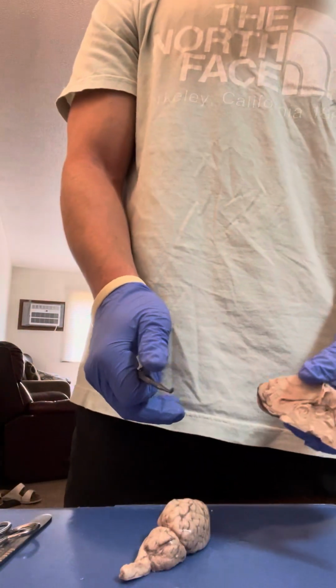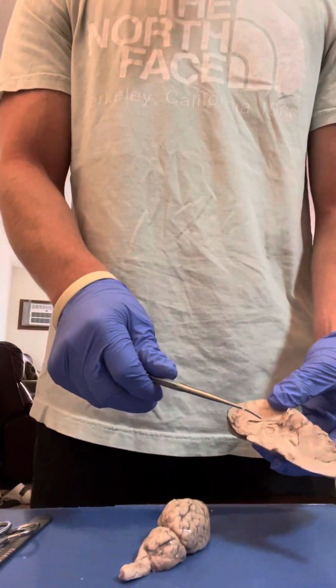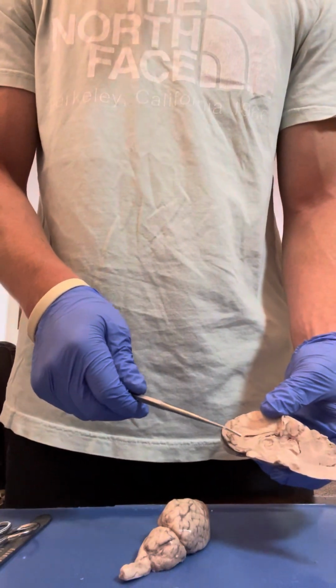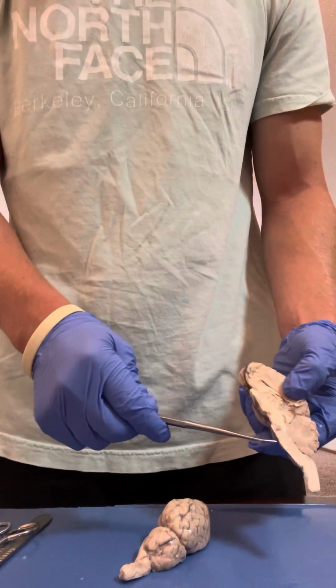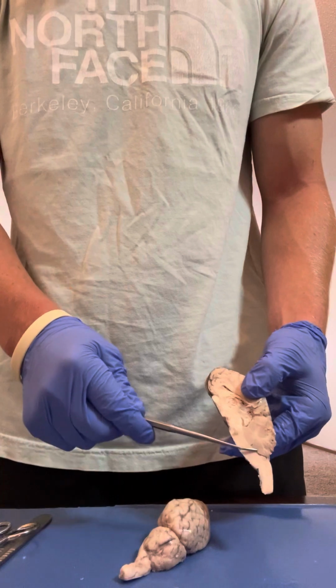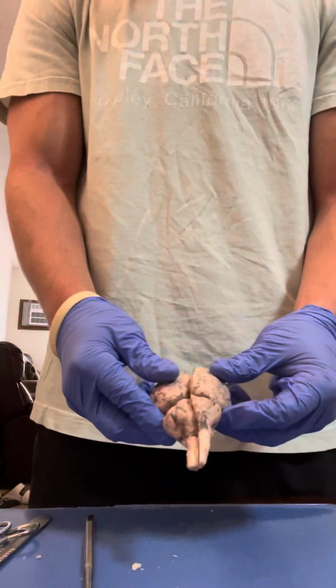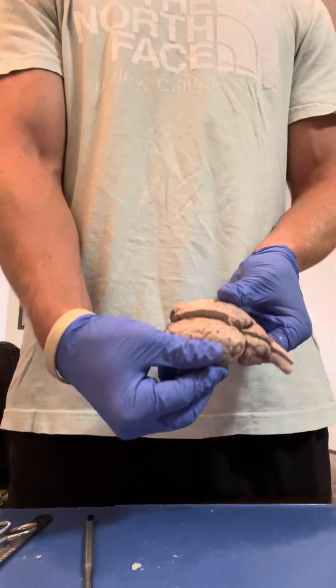And then lastly, we have the white matter, inner portions of the cerebrum and outer portions of the spinal cord. So it's going to be out along here, with the gray matter lying inside. So yeah, that is the brain.